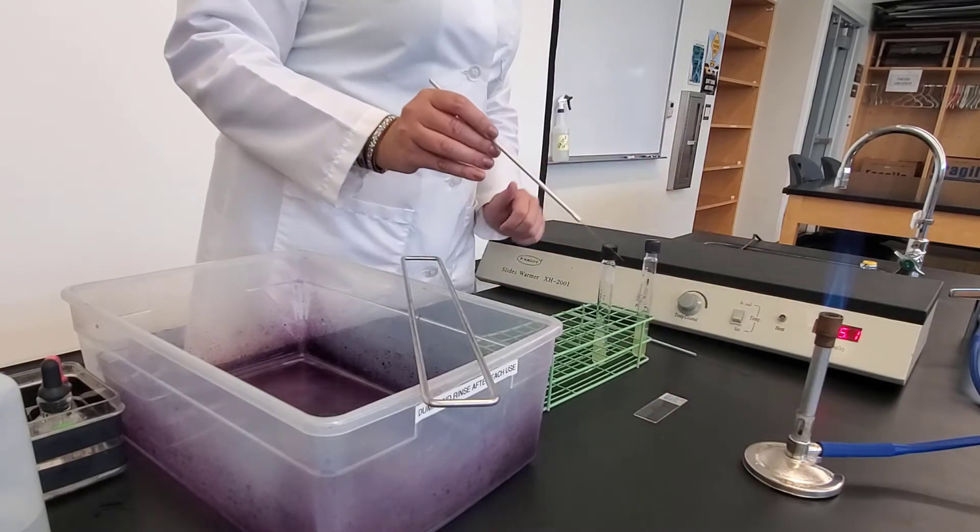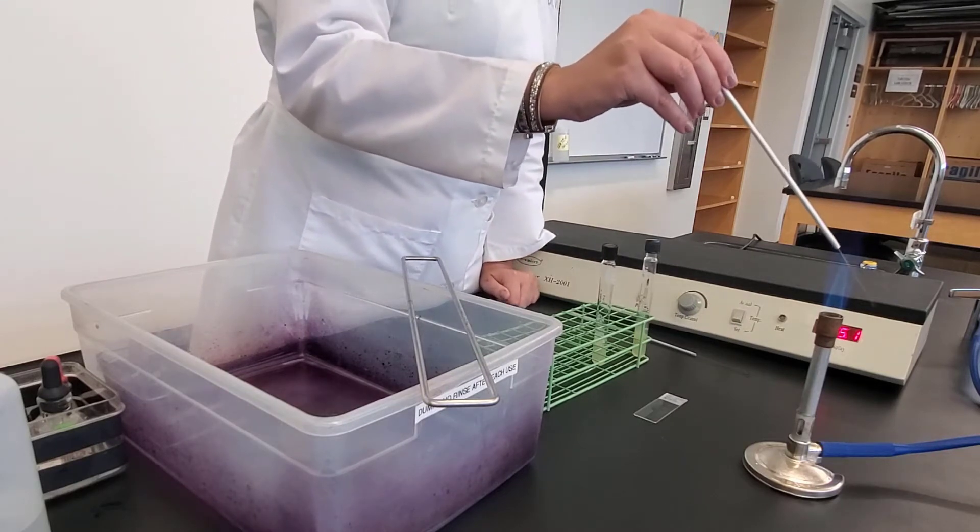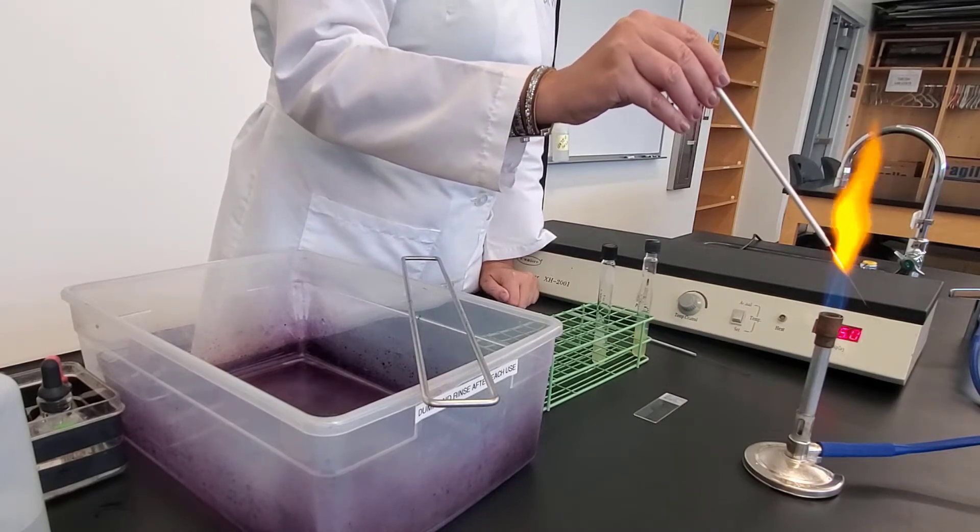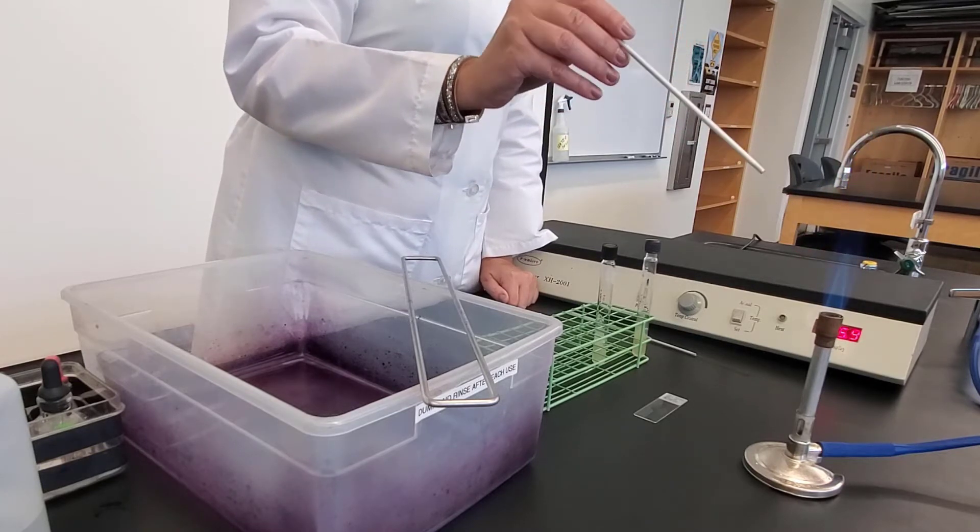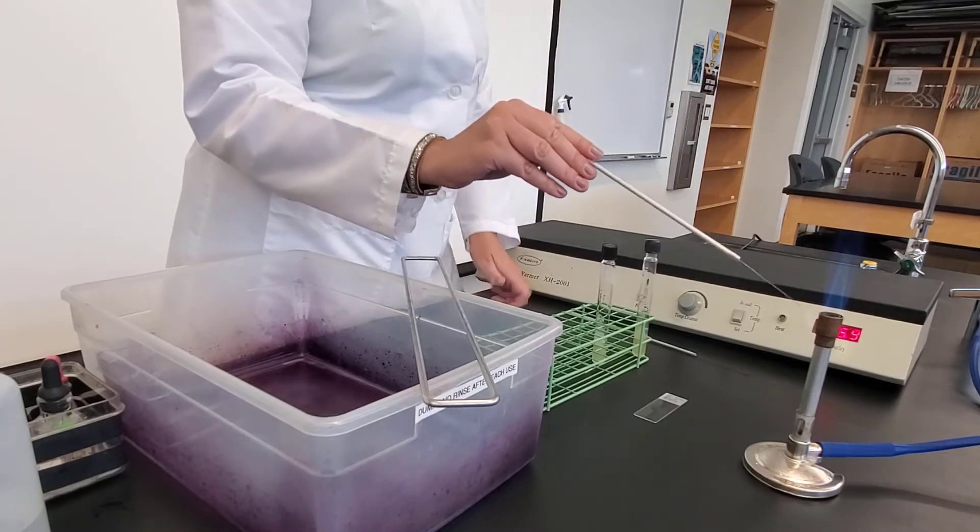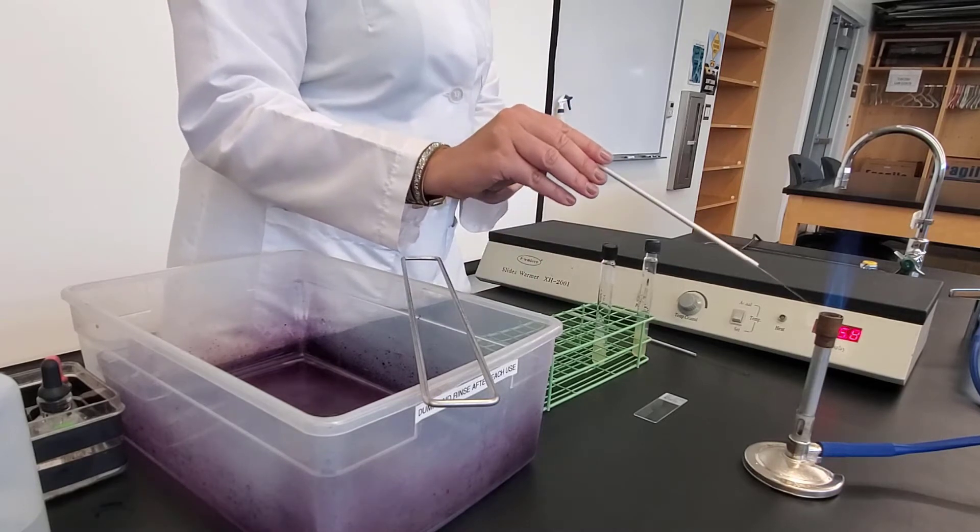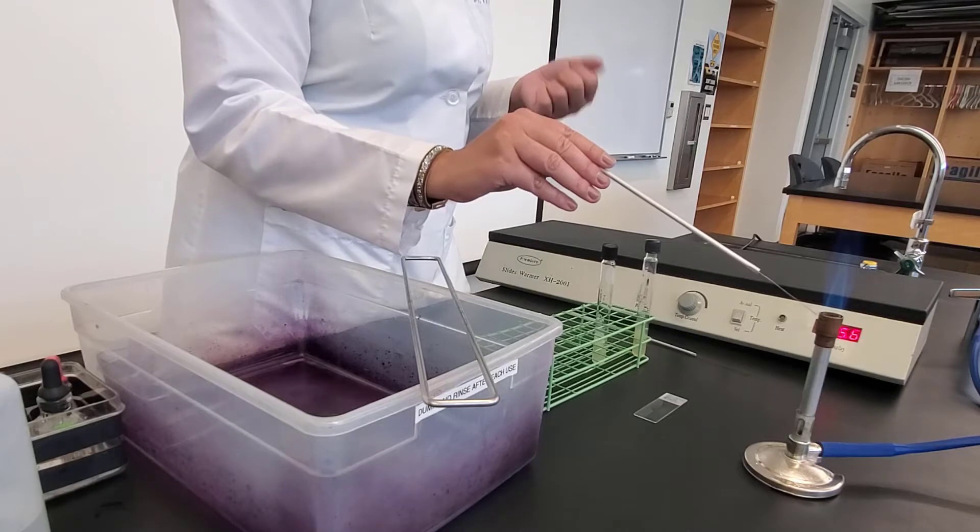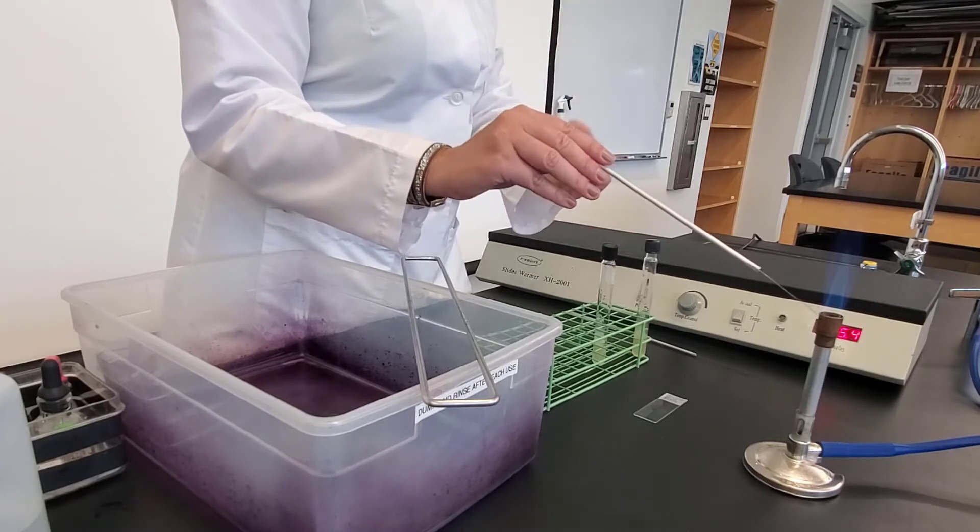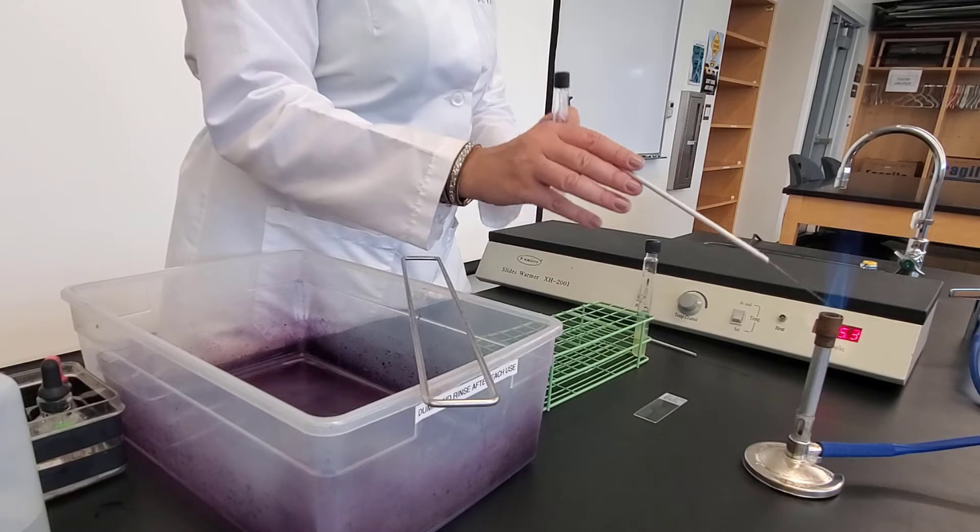So I've transferred one bacteria, so now I need to flame sterilize my needle again. And I'm going to let it cool. Next, I'm going to add my second bacteria. So again, in this experiment, we're using Citrobacter frontii and Staphylococcus epidermidis. So I've already added one. Now I need to add the other.